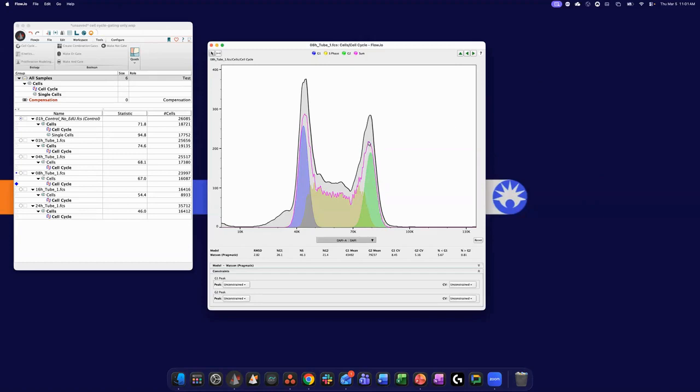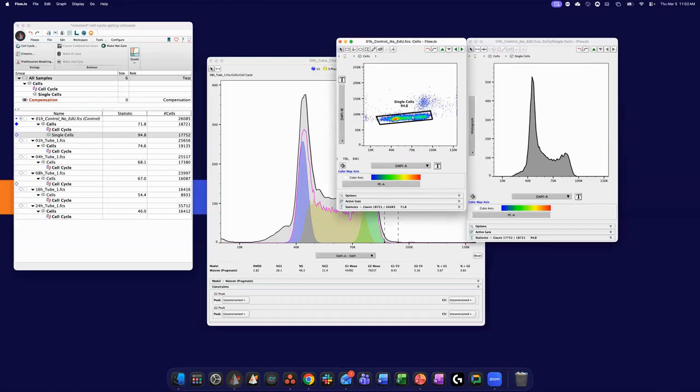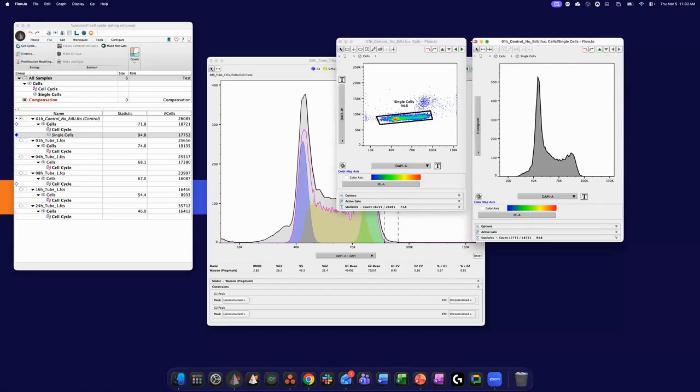have to be looking at these peaks, and if you're doubling or tripling of the DNA content, those would just have to be established with range gates and things like that. So, I'm less familiar with polyploidy, but I imagine that it is just something of a manual process where you're looking for these. Oh, whoops, didn't mean to draw that. You're looking for these more intense DNA content peaks, and having to just manually capture those either in a histogram format, or if you're in a format like we were looking at earlier, something like this where I have like 1N, 2N, 3N, and just kind of capture those with individual gates.